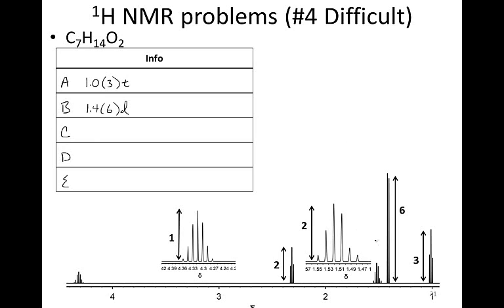The next peak, peak C, shows up at 1.5, and here's the zoom in for that region. So we'll just say 1.5. The integration is going to be 2, and the number of peaks in this overall signal is going to be 1, 2, 3, 4, 5, 6. So there are 6 peaks, and we have a specific name for this.